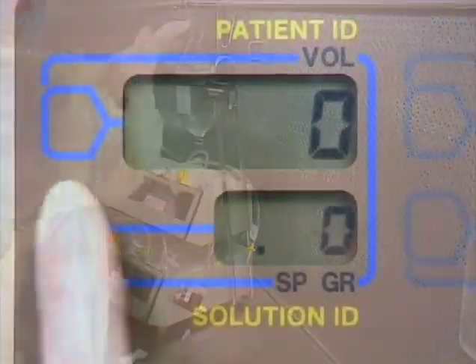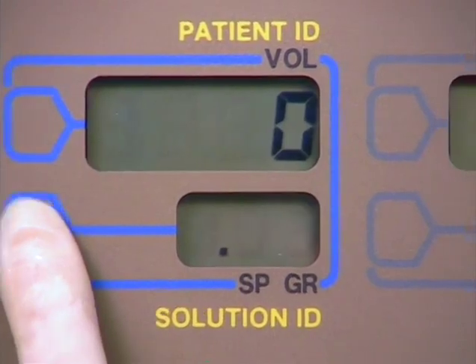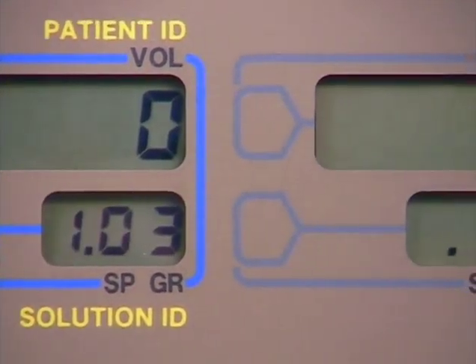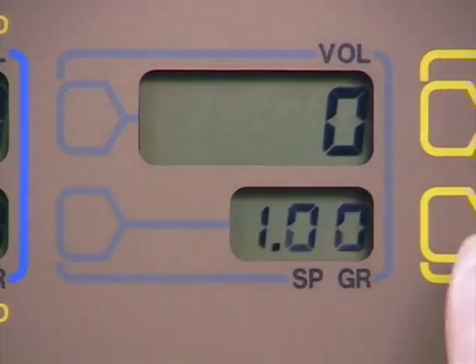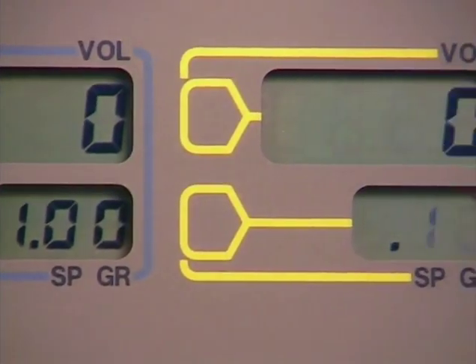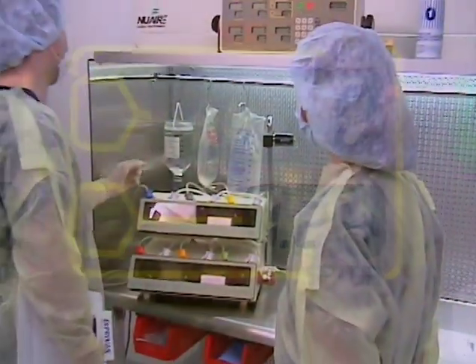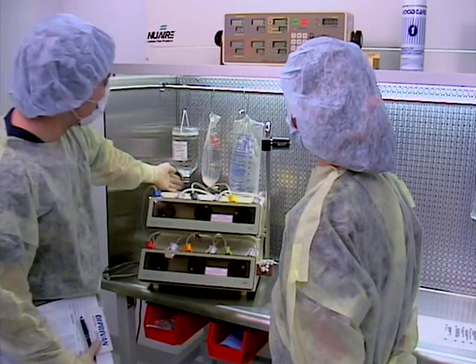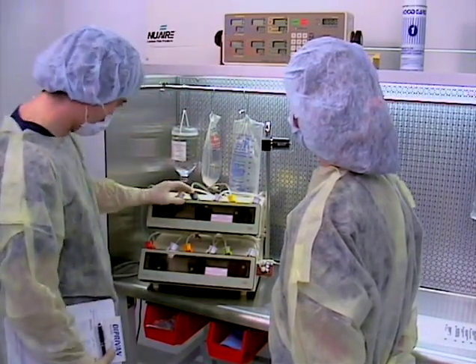The calibration of the unit should be verified on each shift. To ensure accuracy, verify that the correct solution is attached to each station and that the specific gravity entered is correct. Prior to initiation of compounding, a pharmacist should verify solution identities, concentrations, expiration dates, as well as specific gravity and volumes to be pumped against the order.